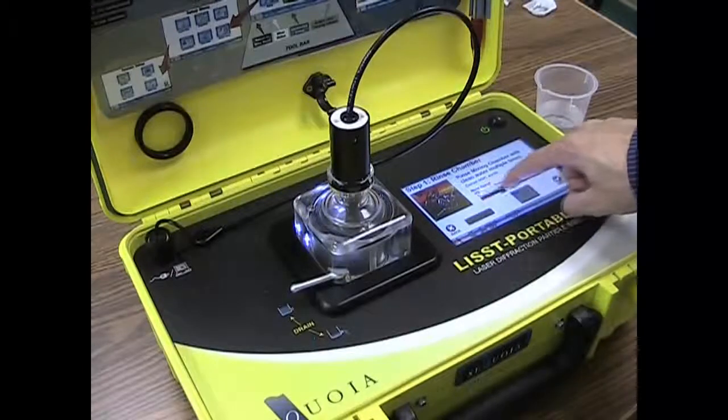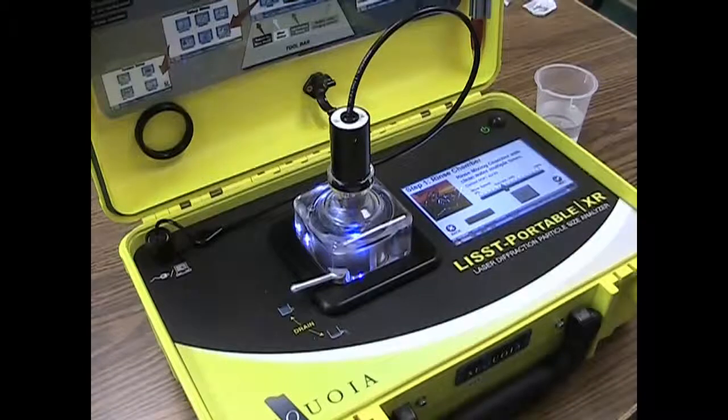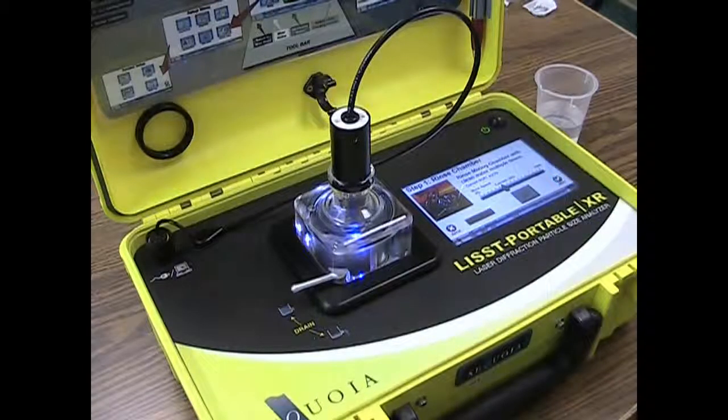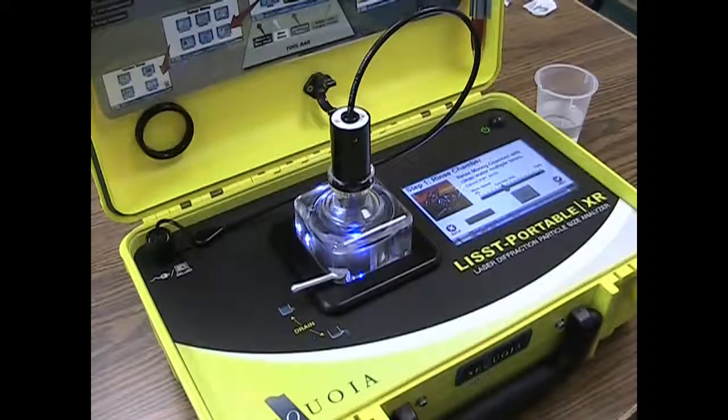Here is an example showing the chamber when it is filled incorrectly. When there is air at the top of the sample chamber, the mixing pump cannot be operated without introducing bubbles to the sample. This will lead to incorrect measurements of the particle size distribution.